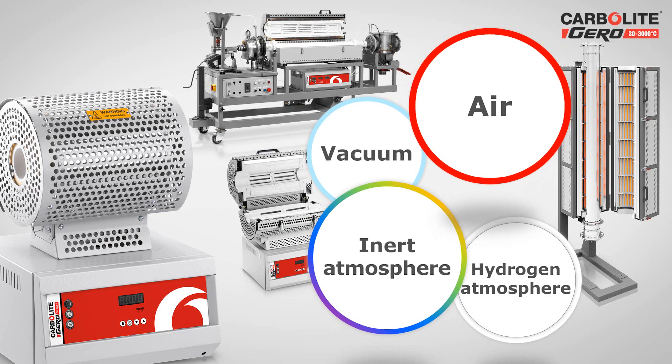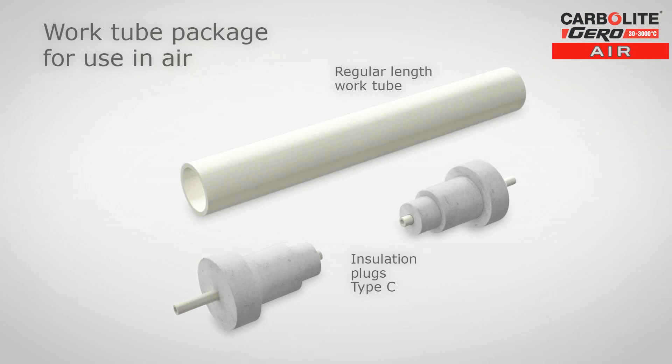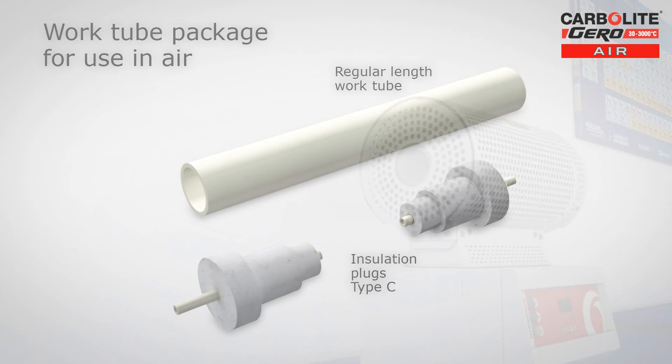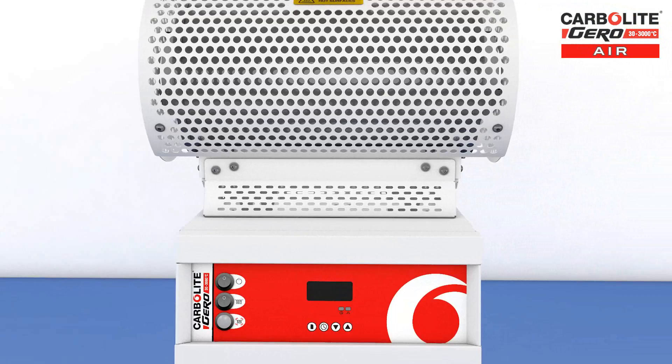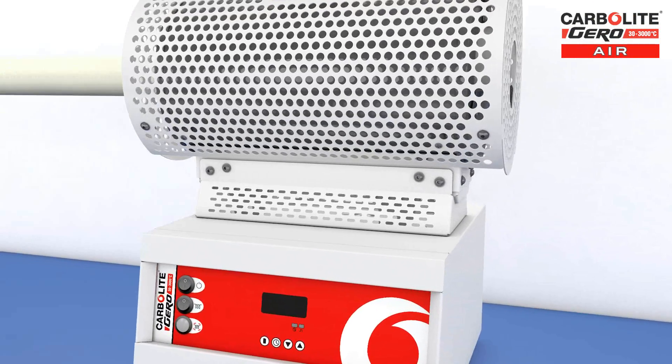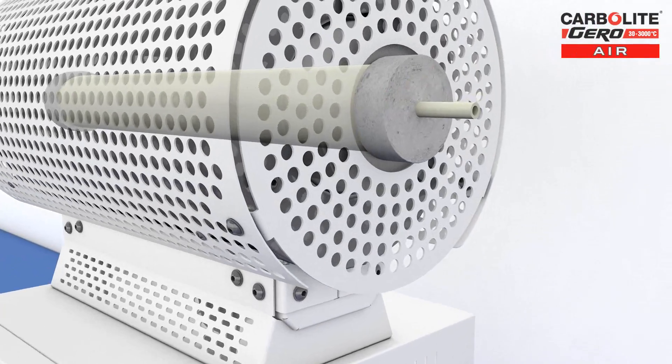Let's start with the simplest: air. To work within an air atmosphere, a regular length work tube and type C insulation plugs are required. These are installed in the tube furnace as shown here. The purpose of the end plugs is to prevent heat losses from the ends of the work tube.